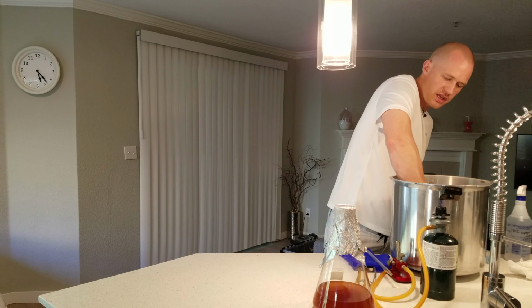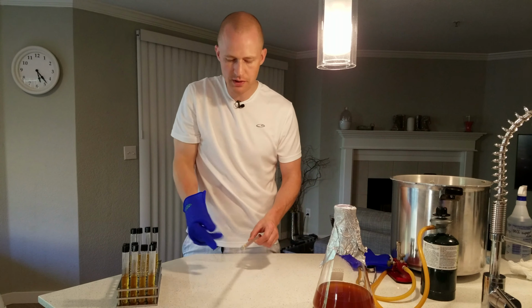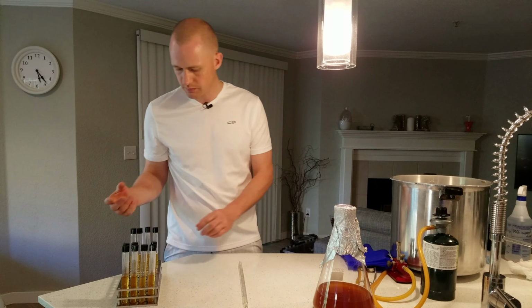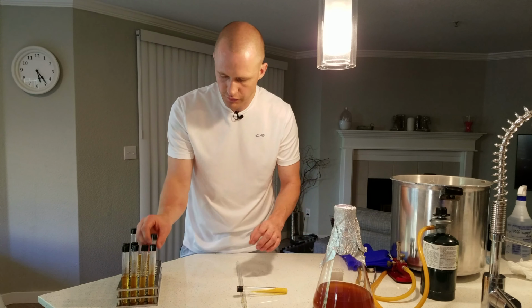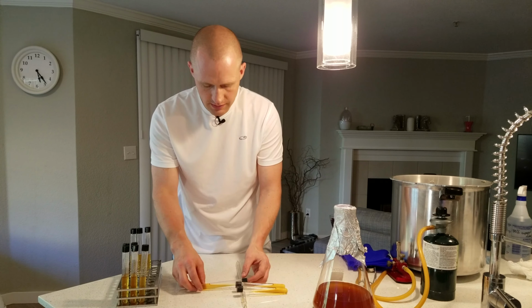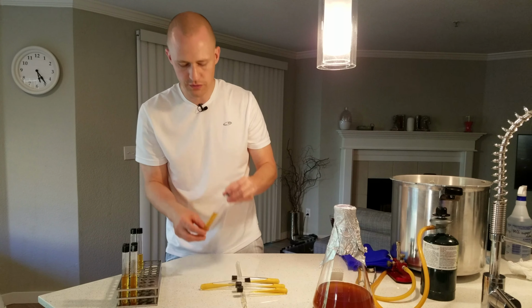So I'd measured out that for me, the 11 milliliters worked out perfectly to give me a good working surface if I stack them up on my 20 milliliter pipette. So just find something, could be a pen or something like that, just to give you a nice incline for your bottles or for your tubes. So we just lay them down. Again, if you measure this out right, then the solution should be at least a centimeter or two away from the tip of the tube.